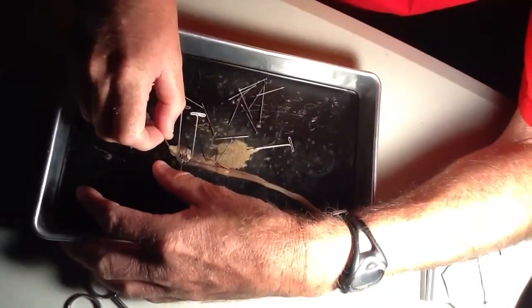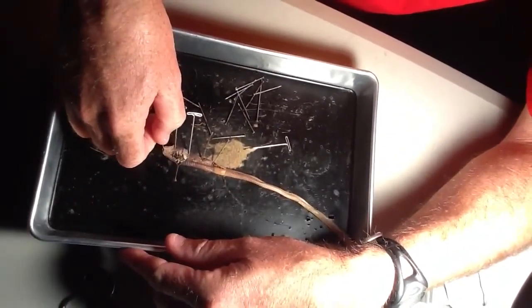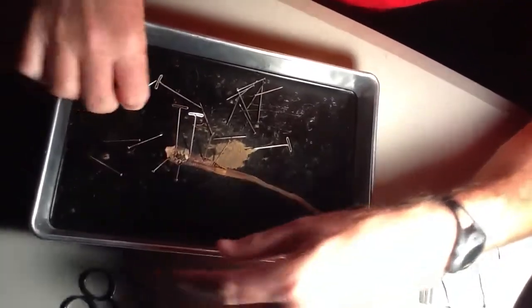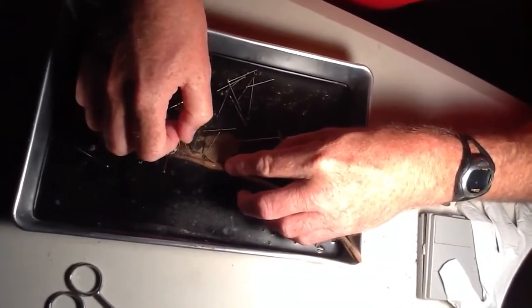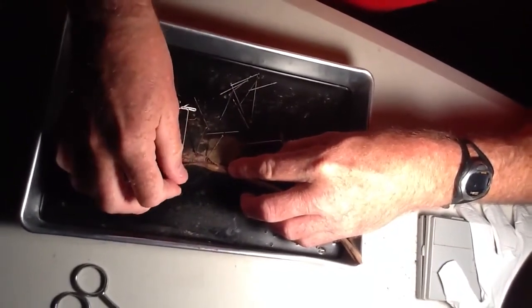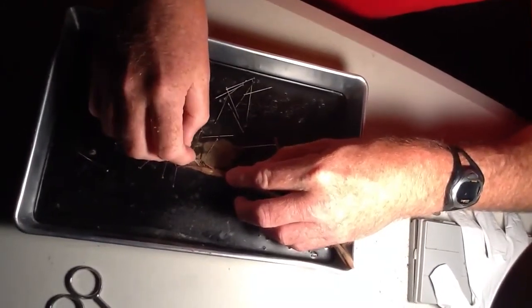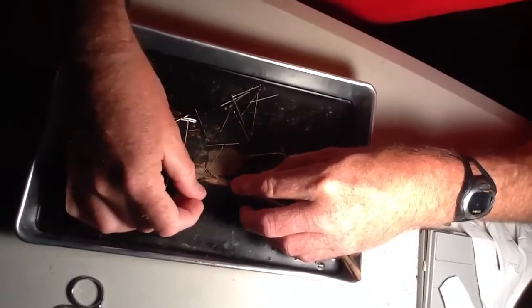So I'm going to take another pin, pull the side apart, and just run it along the side, just inside the side here. See, when I scrape it like that, it almost opens up automatically. Put the pin in along the side, and I'm just tearing the little separating things. And I did not do a bad job. I'm impressed. For having not done it for a year, I did okay. Scrape it along the side, open up.